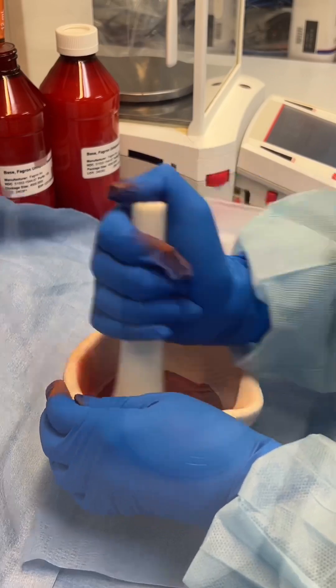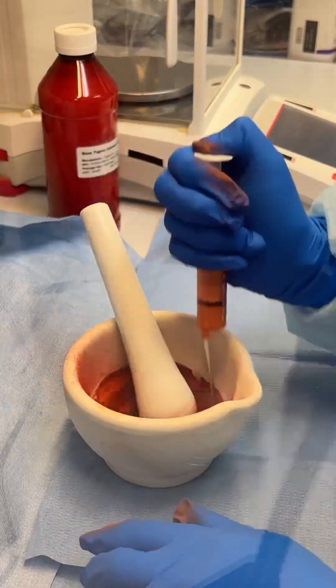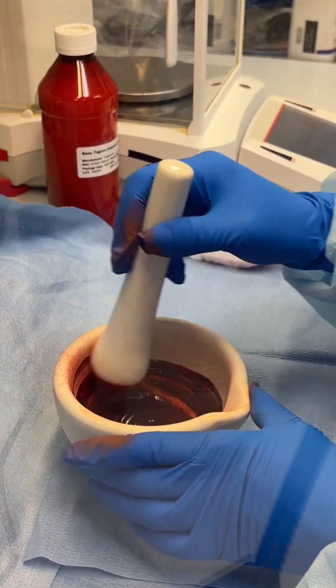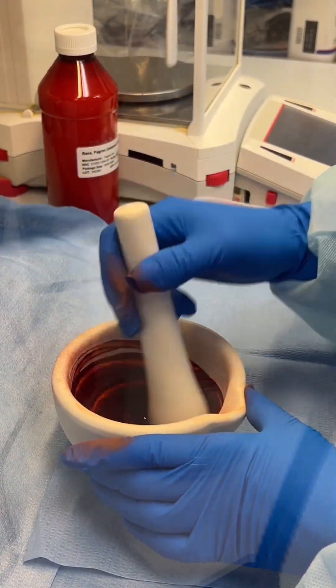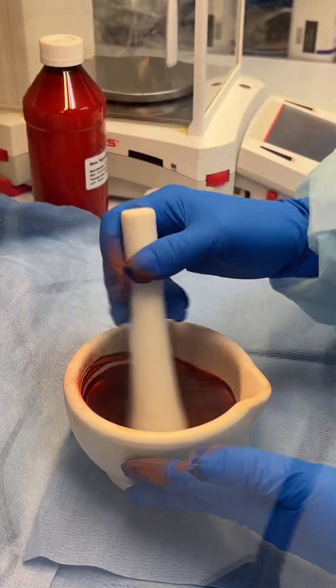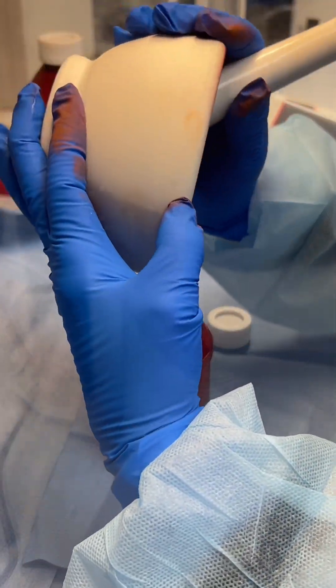Next, we're going to triturate the powder into a fine consistency. After that, we will add a small amount of our suspending vehicle to form a smooth paste. We will gradually add more vehicle, mixing well until a uniform slurry forms.